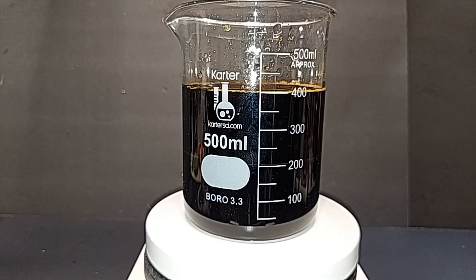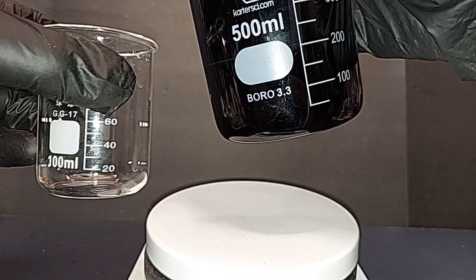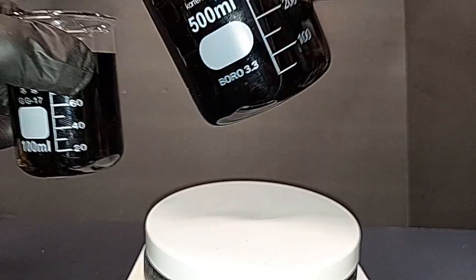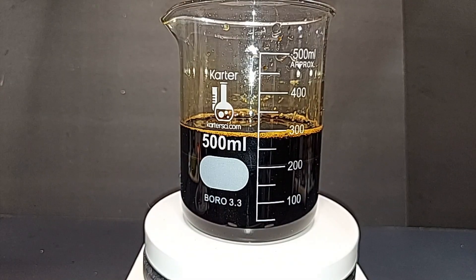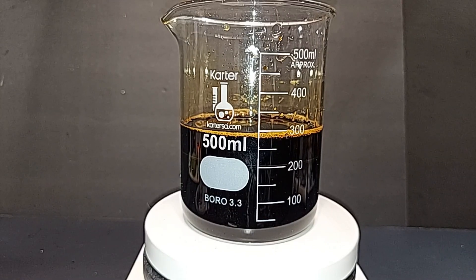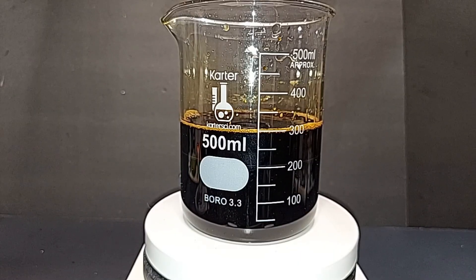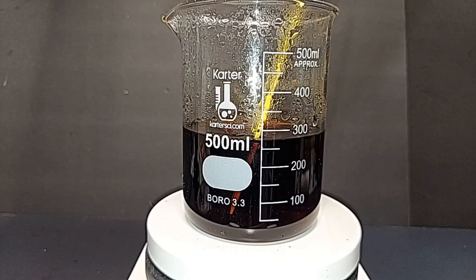I'm going to save about 100 milliliters of the liquid ferric chloride to experiment with later, and the rest I'll heat to drive off as much water as I can. Ferric chloride completely breaks down at around 315°C but starts to break down around 150°C, so I'll keep the temperature between 110 and 120°C with the magnetic stirrer running. The goal is to get this down to about 12.5% of its total volume — that's right around where it gets thick enough to crystallize when chilled.